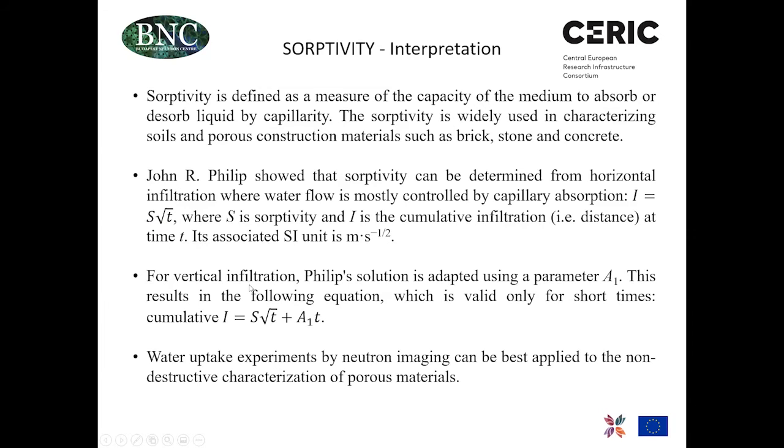While if it is vertical infiltration or water uptake, then there is an additional parameter called A1, and the equation can be extended to this form. And this is what we have seen from our experimental data. And this square root t dependence was plotted in the Excel file.